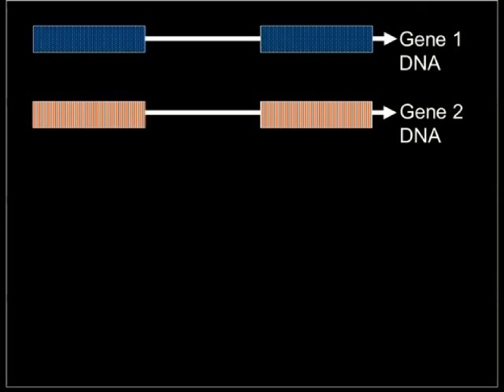So let's start off with the pre-screening, or those methods that we used to use for detecting mutations without actually saying it was a mutation. And those really mostly rely on conformational changes. So a mutation at the genome level will make a shift or a funny shape in the gene or in the sequence, and that will mean that it will migrate at a different rate or a different speed or a different way than the normal. So really we would stick this mutant in and we would stick the normal in, and it would migrate in an altered fashion, either with heteroduplex formations or with the actual conformational shape change.